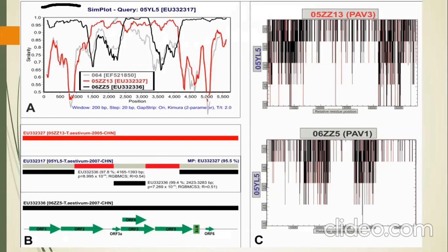Then this is the red one. The forthcoming sequence will be this one, followed by again the black one. This one is high, and after that again the red one, and after that again the black one.